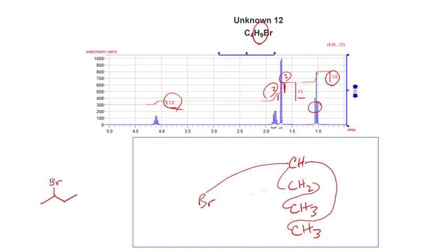We're going to use absolutely the minimum information from the spectrum that we need. We're going to start with looking at the symmetry to see if we have all the hydrogens or half the hydrogens or something like that. We're going to get all the groups that we think we have in this box. We're going to try to put it together. If it works, we're done. Now, we have a lot more information in the spectrum, and it would be wise to look it over a little bit and maybe even learn something from it in terms of our structure.